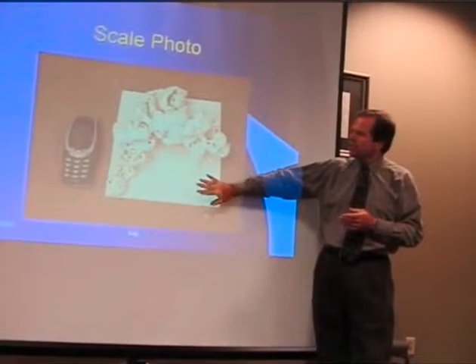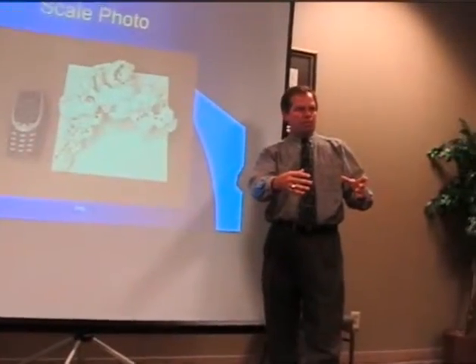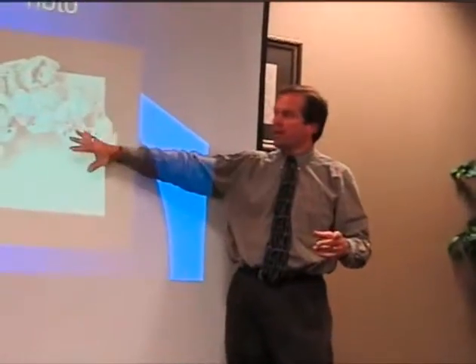So that's how this thing works. This just goes up, builds up in layers. So you do have to design a base for it, and you do have to figure out what the 3D height is, and then sort of fit it into what you need. So this takes multiple passes.